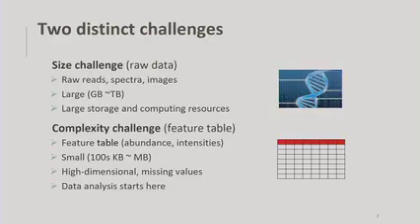So metabolomics data analysis is the same as other omics. We have two major challenges. One is raw data processing. If yesterday you took the workshop using MZMine and other popular tools, it's challenging, but it's getting better and standardized. So you generate your data in an open format, and you use MZMine or other tools to process your spectra.